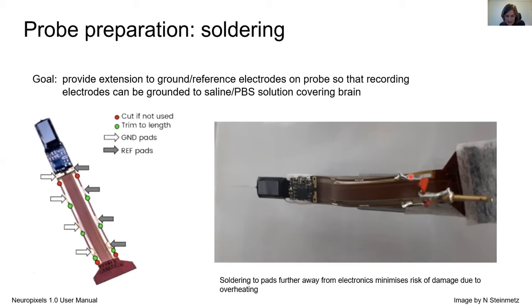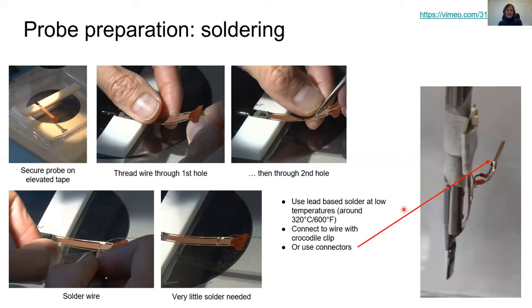Here you can see how this was done. We use those topmost patches. So how to do the soldering, there are very nice videos. You first want to secure your probe, for example on an elevated tape. You take your wire, put it through the first hole on one side, then through the second hole on the other side. Then you solder the wire to both patches and very little solder is needed. You should use lead-based solder because this can operate at low temperatures.